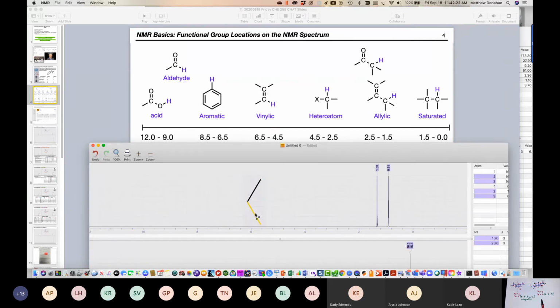So I'm basically going to make this now a double bond. So you see this carbon here, it was about 0.2, how it now shifted into this different region. And that's basically because we bonded this other group now to that carbon. So as we change the environment, you'll see these things shift.